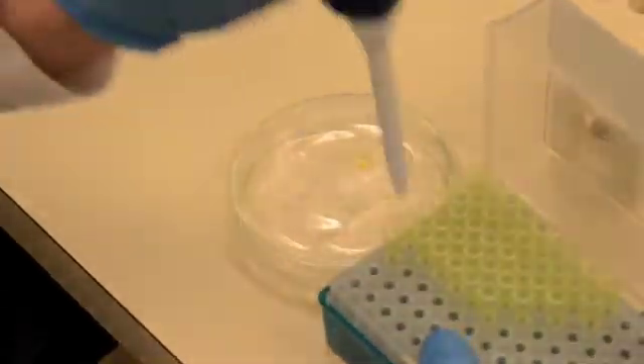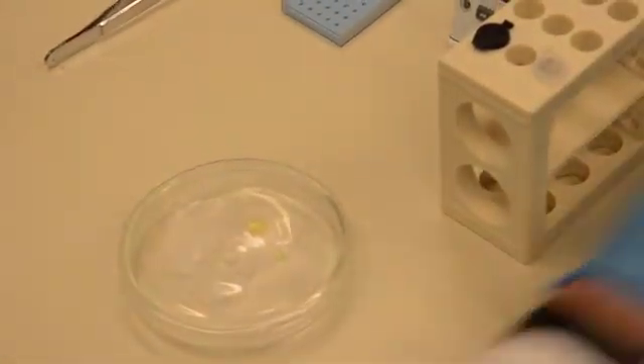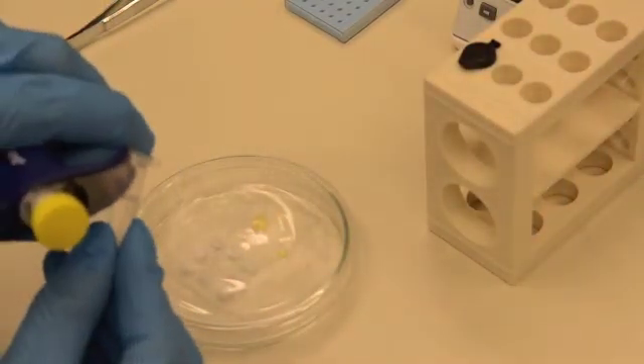Next, pipette 20 microliters of lead citrate onto the parafilm so that the droplet is surrounded by sodium hydroxide. Lead will precipitate with exposure to carbon dioxide, so be sure to cover the petri dish.